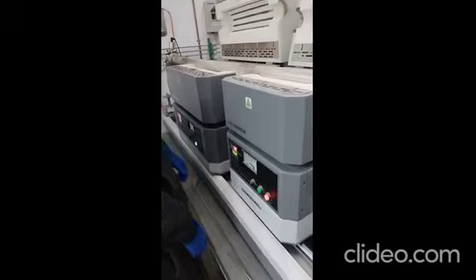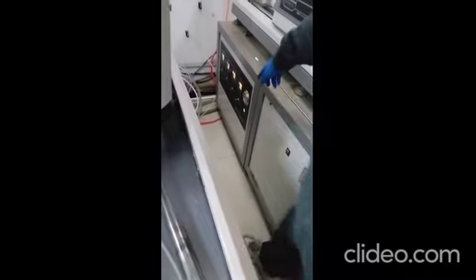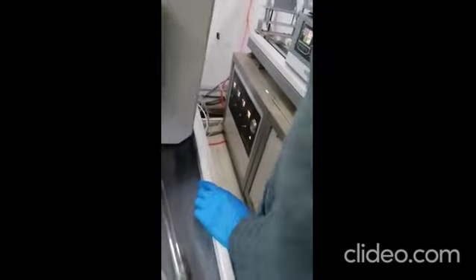So first we use high flow argon gas, to blow out other gas. Yes, okay. The first step.